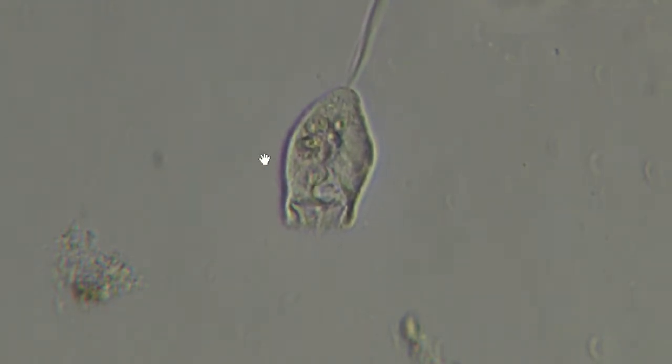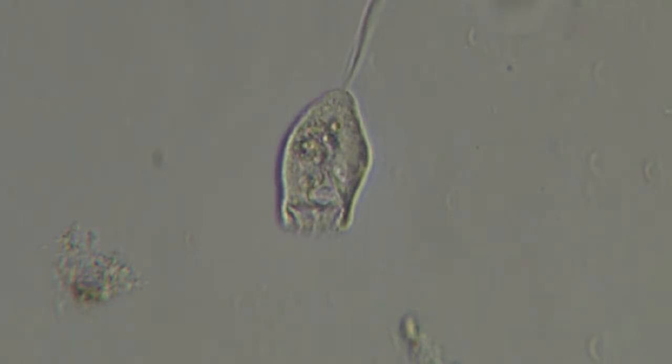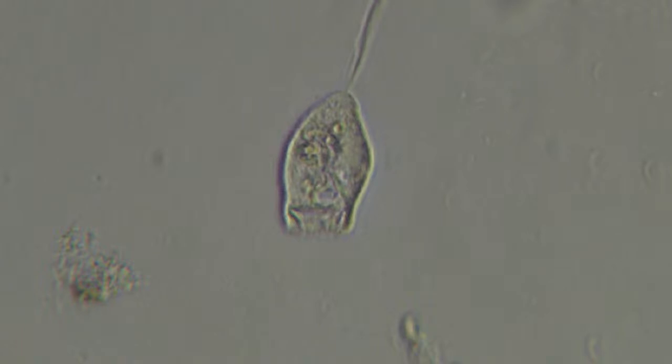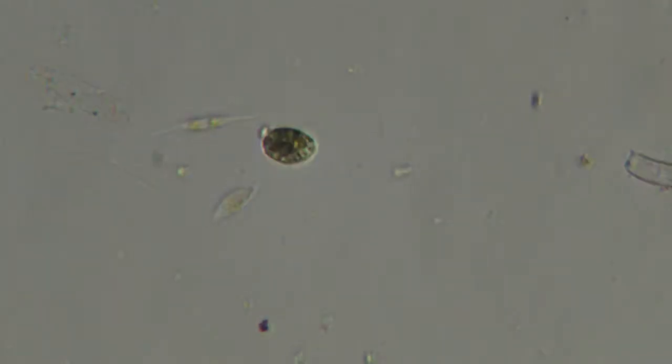Yeah, so the vortex is swimming like that. And mostly eating bacteria and very, very small protists, you're not seeing a lot of their food unless it's like a cloud of stuff or the contrast is just right. So it was really cool to just see diatoms and other stuff in the area bouncing off of it with this vortex created by it. It's a really strong vortex. Hence the name Vorticella.